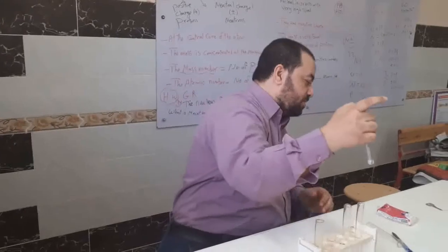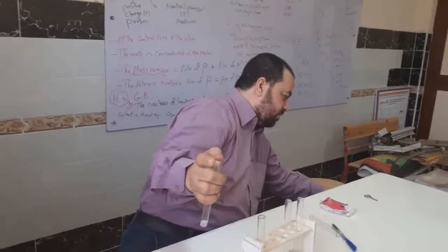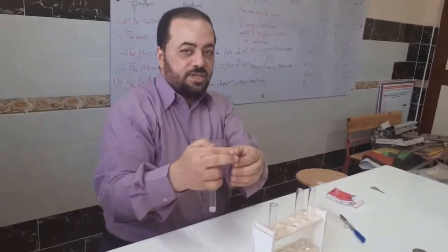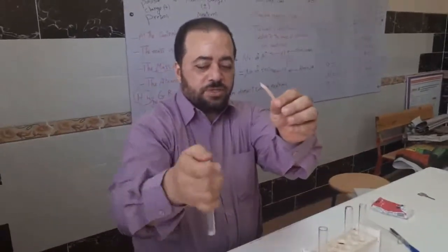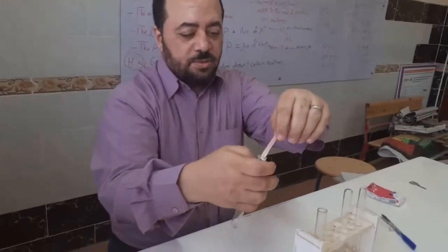Red litmus paper will turn blue with magnesium hydroxide. This is the red litmus paper. We put the red litmus paper on the magnesium hydroxide.